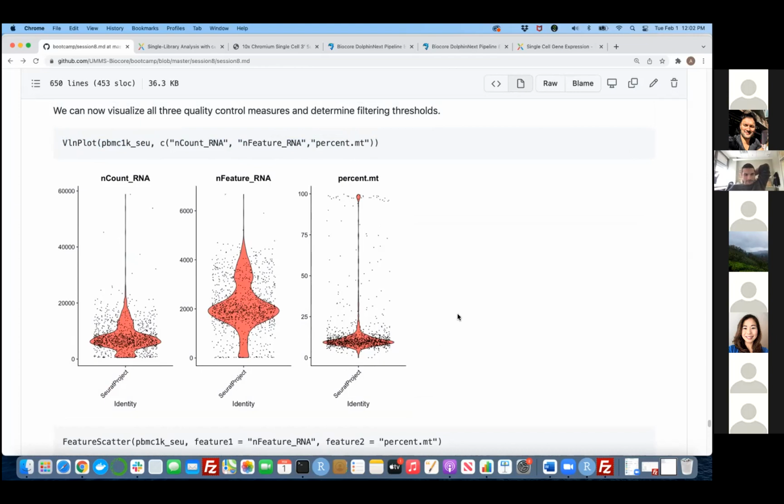Let's say we have a normal healthy cell that's not undergoing apoptosis, and we're taking it through the 10x pipeline. Would you normally not expect it to contain any mitochondrial RNAs? I'm assuming the mitochondrial RNA is doing some sort of function in the cell. So you expect that during the RNA isolation process on the bead.